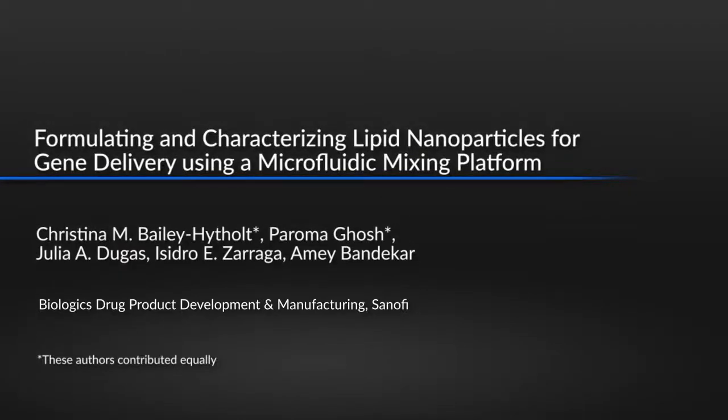This protocol can be used to produce nucleic acid encapsulated lipid nanoparticles with high reproducibility and speed and low volumes. The formulation parameters can be tuned to achieve a desired biodistribution based on the clinical application.